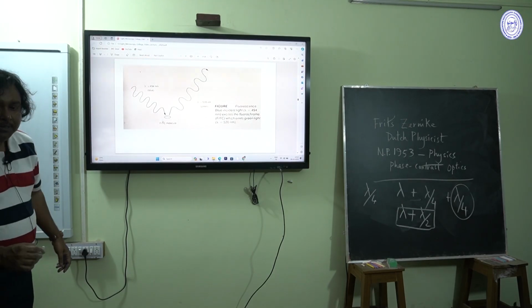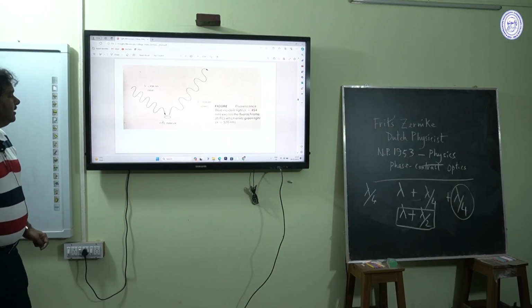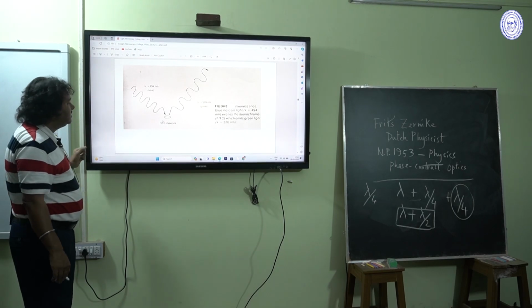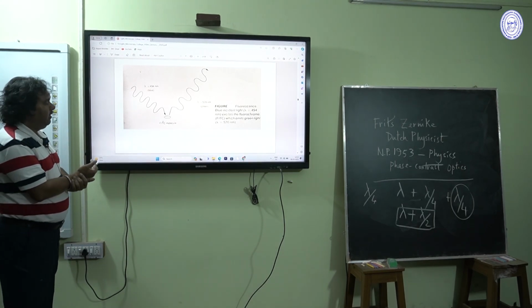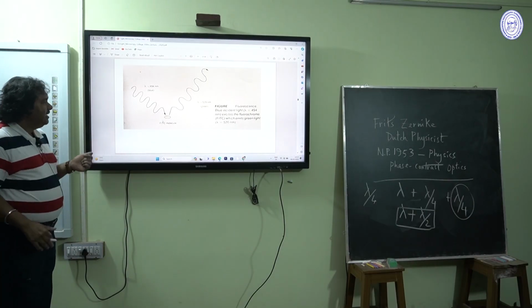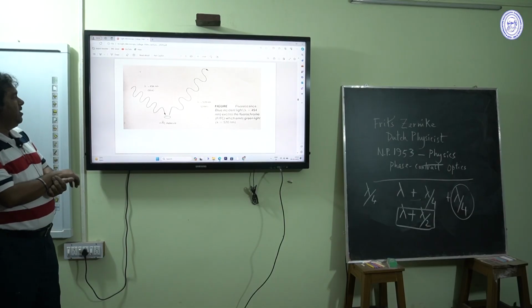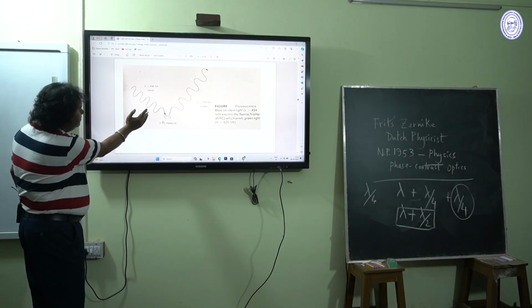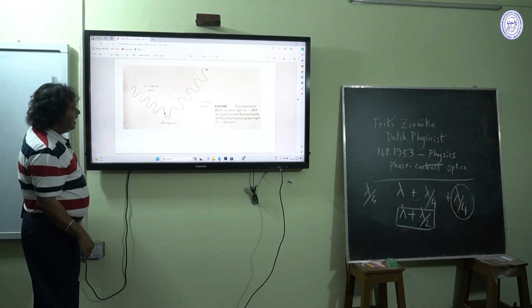This is the fluorescence blue incident light. This is the FITC molecule, that means fluorescein isothiocyanate. It has an excitation maximum of 494 nanometer, which is blue in color.